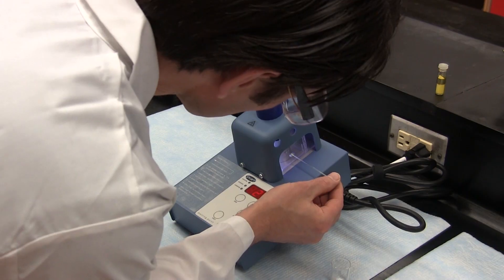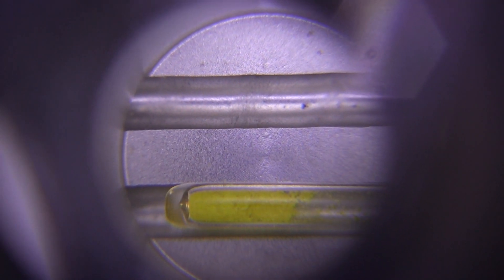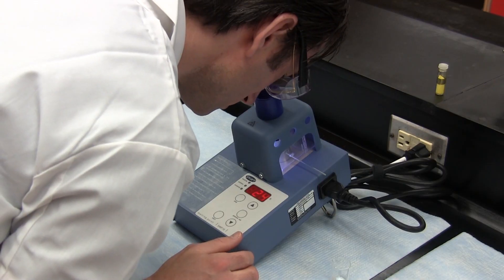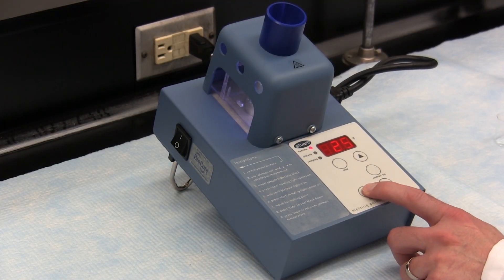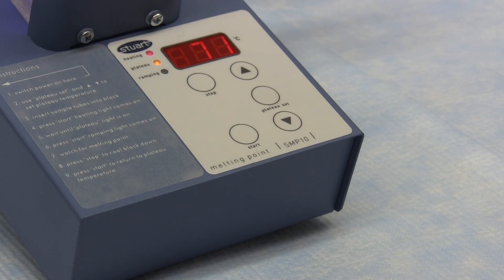Insert the packed capillary tube into any one of the two holes on the side of the heating block — this can be done from either side. Look down the magnifier and position the tube so that you can see the sample clearly. Be careful because the heating block may be hot. Press the start key and the unit will quickly heat up to the plateau temperature while the heating light is on. Once the plateau temperature is reached, the plateau light will be illuminated as well as the heating light. You should wait until the plateau light comes on before proceeding, as this ensures that the temperature is stabilized.